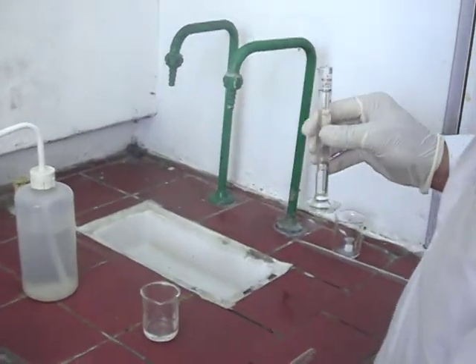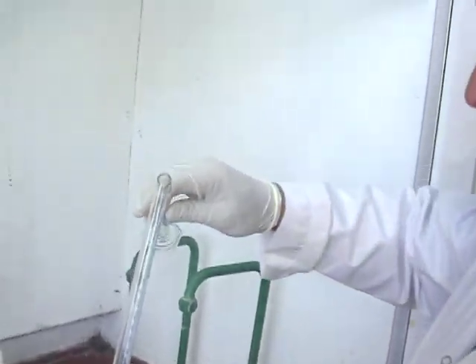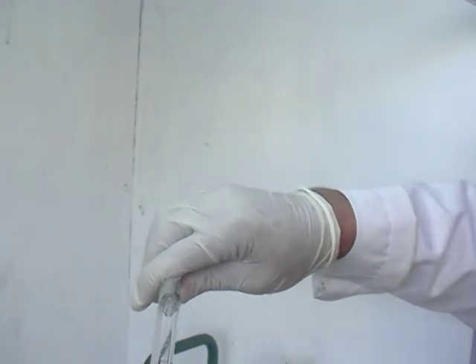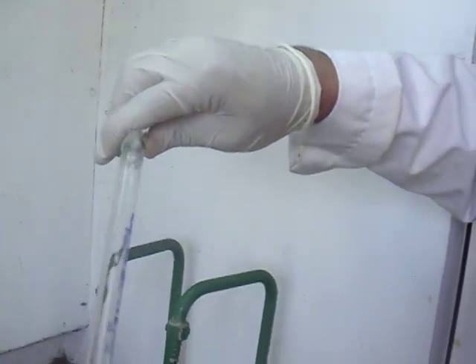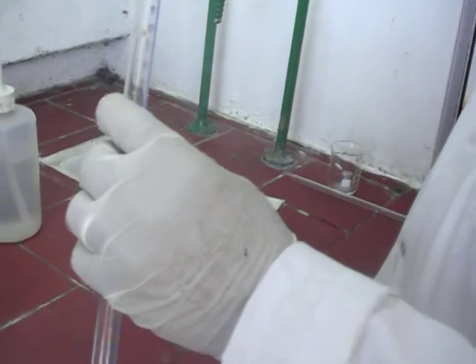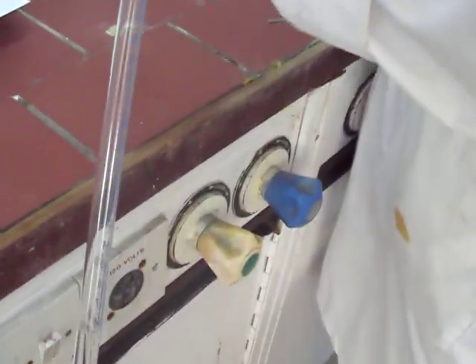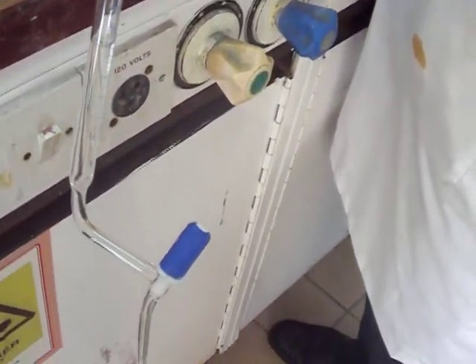Measure approximately 10 ml of the hydrochloric acid and add them to the burette. The tap of the burette has to be closed. Be careful again because it's very corrosive concentrated acid.